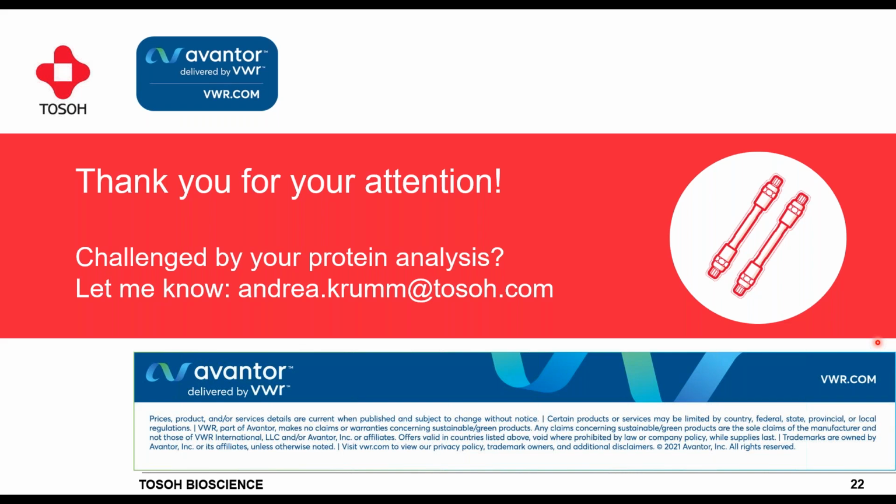Yes, they can be added with some caution, because you can imagine if I have a very high salt concentrated buffer together with an organic solvent, it may be prone to aggregation, so to precipitation. So you really need to check it up front again in order to see if you have any precipitation. But in general, it works, and one popular way to use it is to add it, for instance, into the elution buffer, so to buffer B, so that you have an accelerated elution from the column, or that you have better elution from the column.